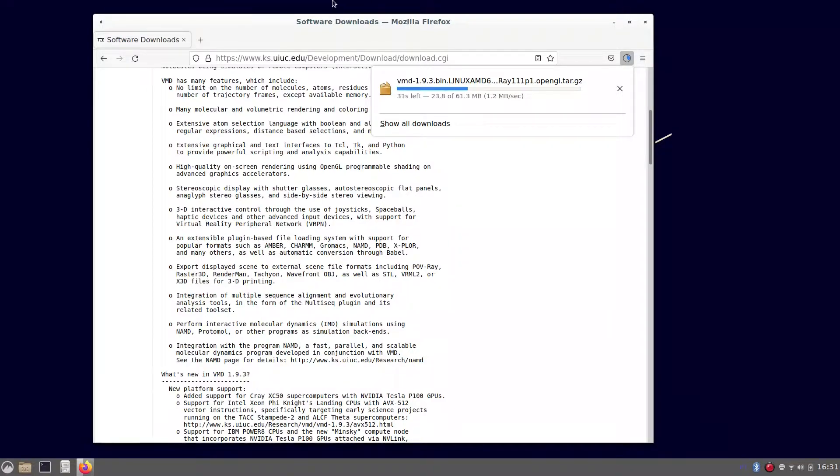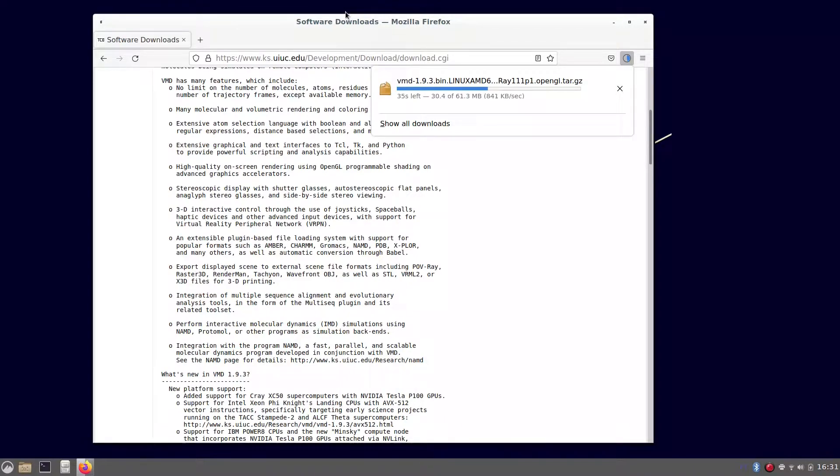You can make videos, and obviously the goal of this video is to show you how to install VMD to work with REDTool, the ribosome angle for the composition software. Other nice VMD features can be found on their website or elsewhere on the internet.